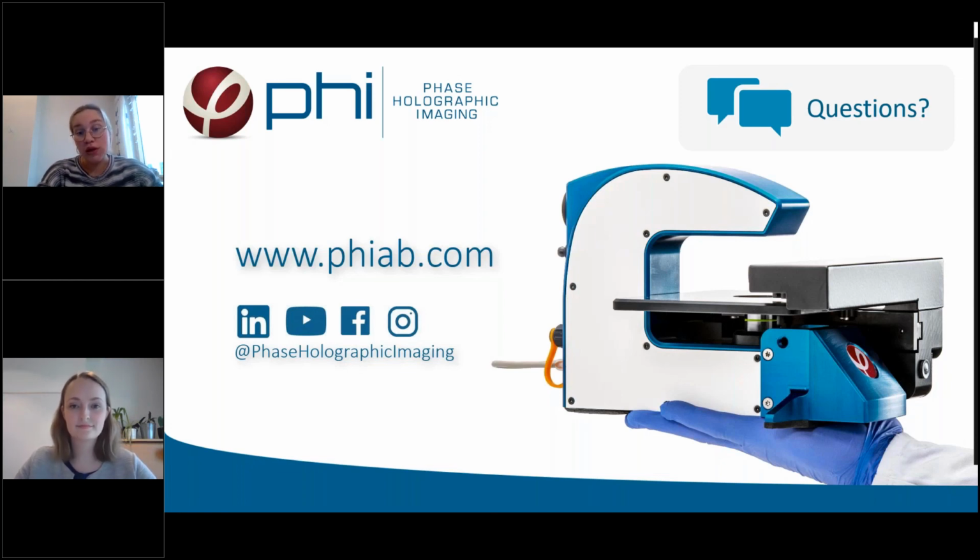And you can choose the color sets for your cells in whatever way you want. So you can generate your own color sets, and this will be exported together with the images or movies. And you can also view the cells either in 2D or 3D. You can zoom in to a certain part of the image or use the whole field of view.